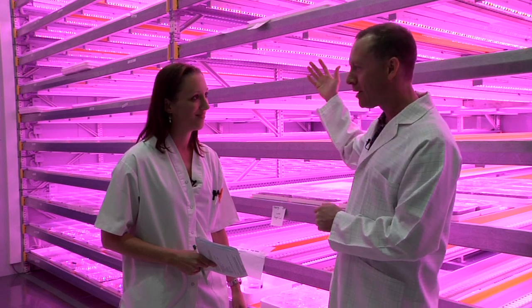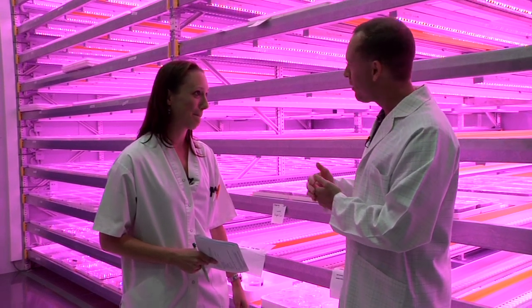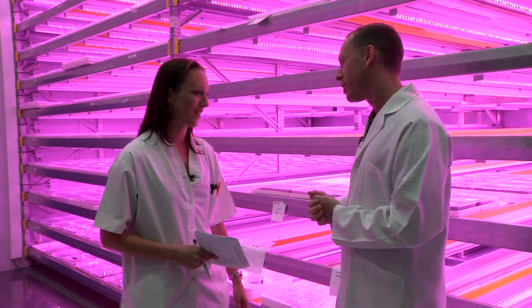To our eye, it looks very pink, it looks very purple. And the plants actually don't look green under this light. So my question is: how did you decide to invest in light emitting diodes, and how did you test to determine what is a good ratio of red and blue light?